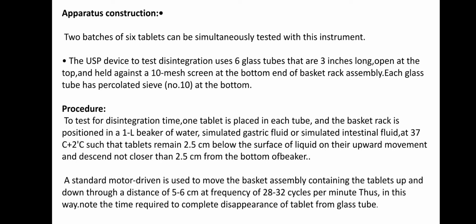Apparatus construction: two baskets of six tablets each can be tested simultaneously with this instrument. The USP device uses six glass tubes that are 3 inches long, open at the top and held against a 10 mesh screen at the bottom end of the basket rack assembly. Each glass tube has a perforated sieve number 10 at the bottom.